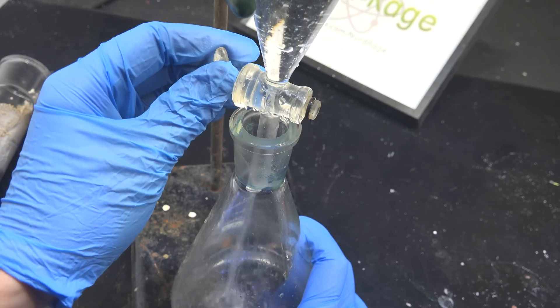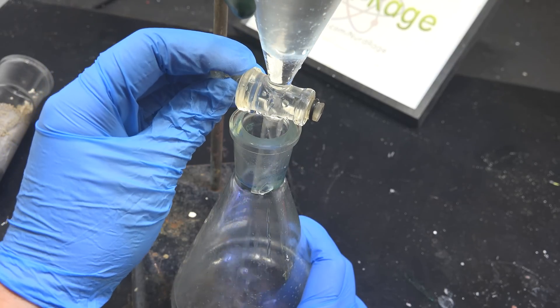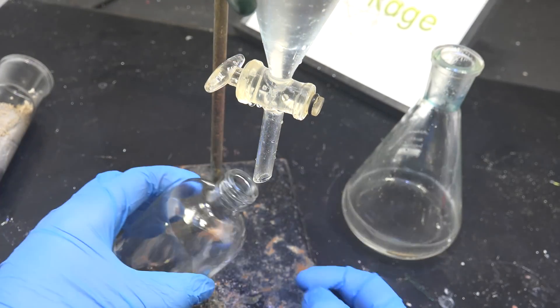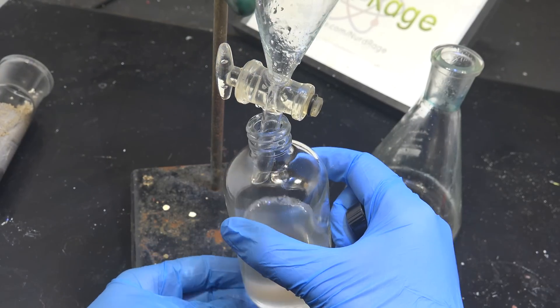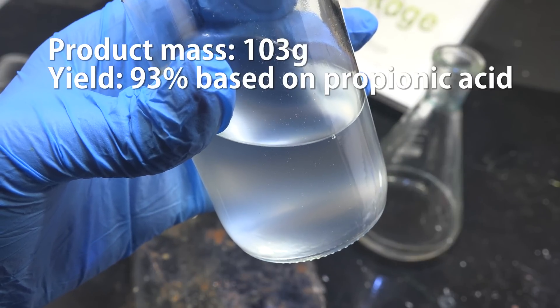You might be wondering why I'm washing with water when water destroys ethyl propionate. While the mixture is cold, the reaction of water with ethyl propionate is very slow — it's only when it's hot that the reverse reaction becomes a problem. Nonetheless, when I store this I'll be sure to remove all traces of water. And there it is: crude ethyl propionate. The mass of this is 103 g for a crude yield of 93%.